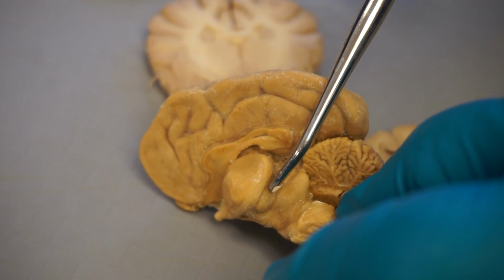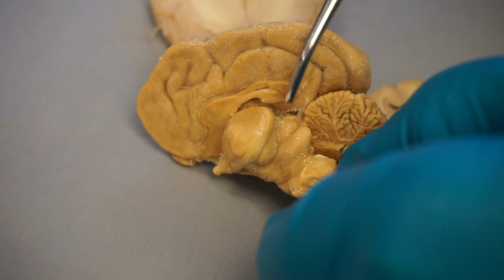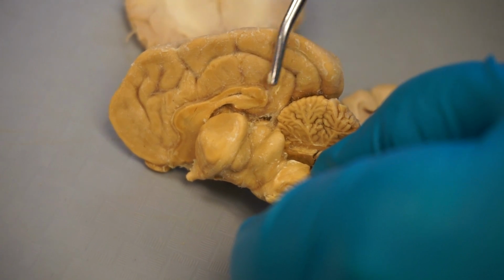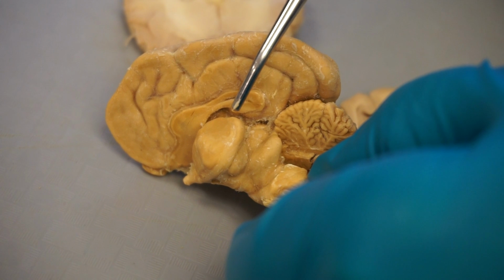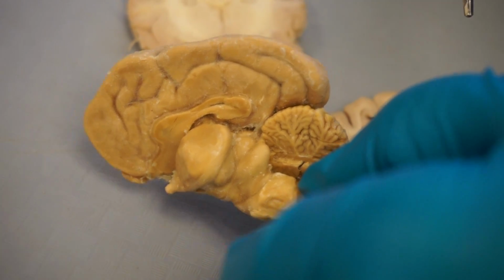Those are part of diencephalon. This is conscious vision, conscious hearing. The other two bumps, rostral and caudal colliculi, are part of that mesencephalon. So this last part of diencephalon tends to overhang the mesencephalon.